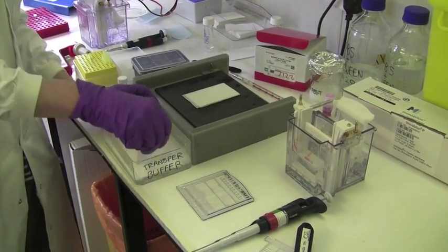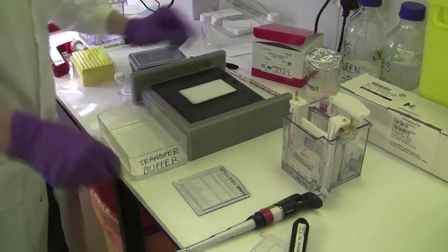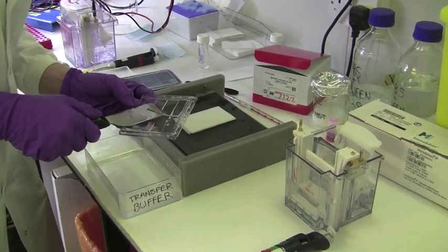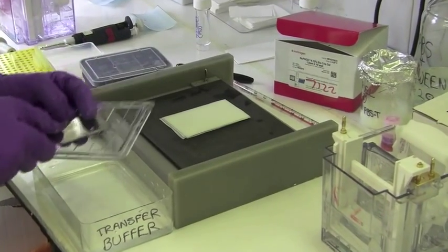Filter paper, pre-soaked in transfer buffer, is placed on the platinum anode before pre-soaked membrane, commonly nitrocellulose or PVDF, is added. The gel is then placed in direct contact with the membrane.